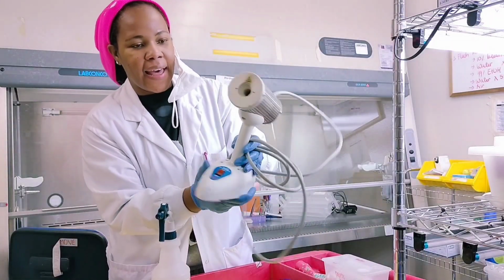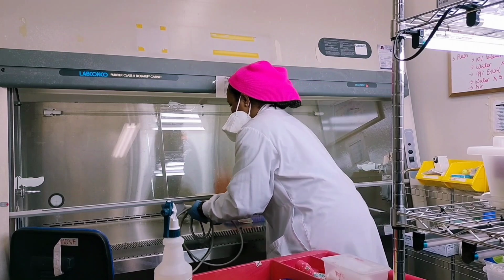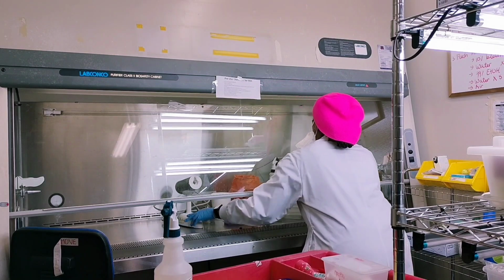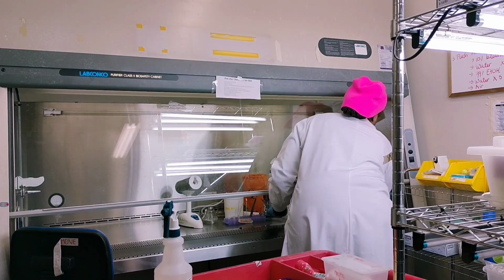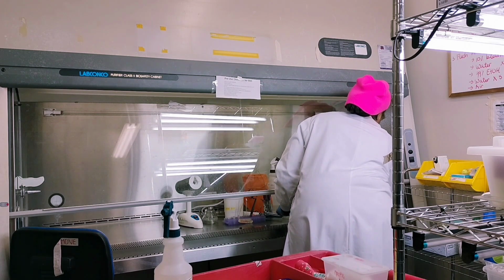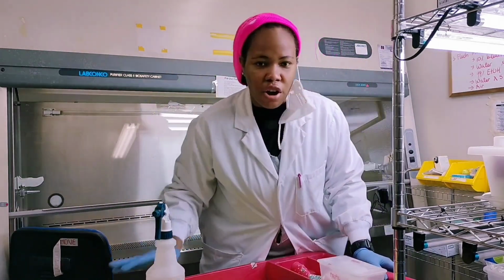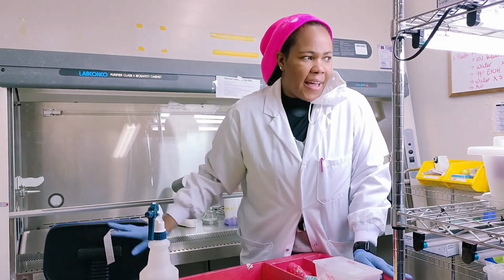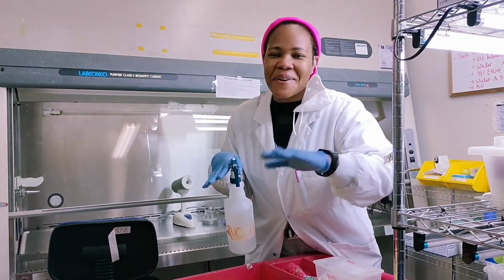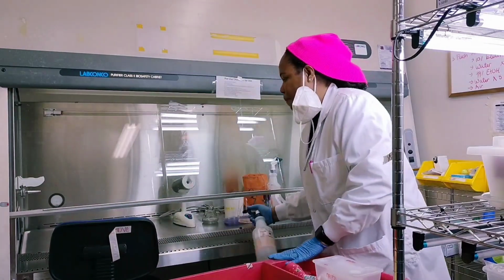This is what it looks like, and inside here glows orange. I'll turn it on so it heats up, and I'll just let it breeze out, the air equalizes, and then when I'm ready, I'll start my work.